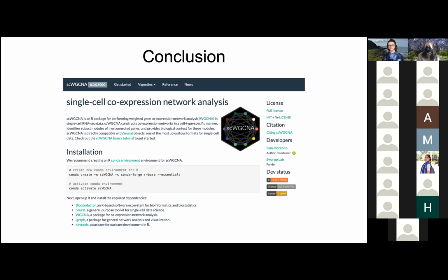This is a question that's kind of on the tail of Vincent's question. You mentioned that you tend to run WGCNA on each sample and cell type combination. So what happens if your clinical variables are split based on those samples? You have your disease samples and control samples, or maybe I'm just misunderstanding something.